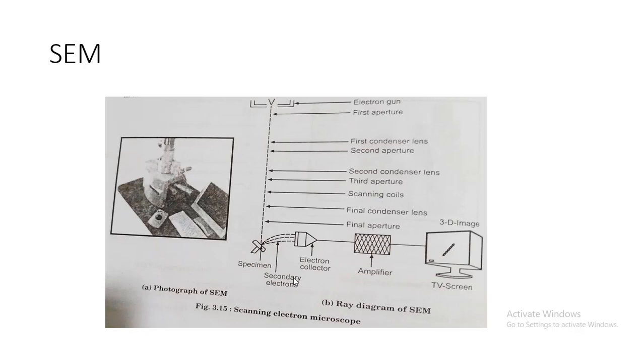In the pharmaceutical field, scanning electron microscopy is very useful in studies associated with surface characteristics of drug particles and morphological studies of antibiotic producing microorganisms and their spores.